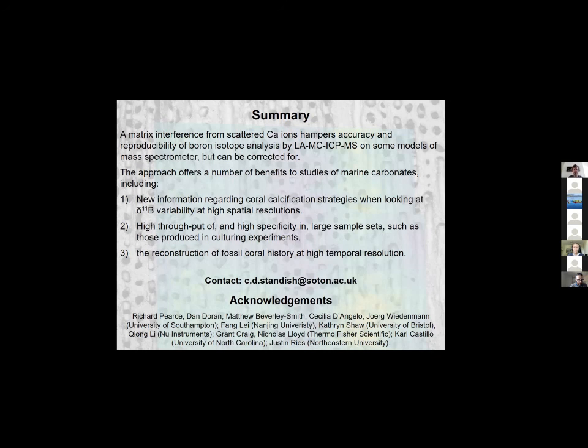We've not really got down to sort of the planktic levels of boron concentrations yet, but we have had a go, and I think it's more to do with the samples that we've been analysing. So in theory, they should be fine because we can get accurate data for standards at sort of 50 micromoles per mole boron calcium, but the samples haven't been able to hold up in the laser cell to the ablation. So that's something I think should be possible, but we've not got down to those levels yet.